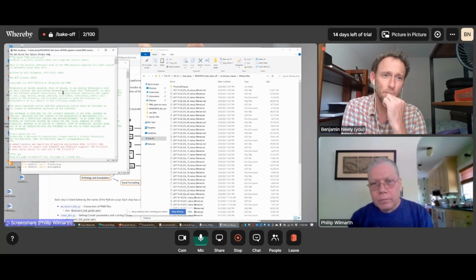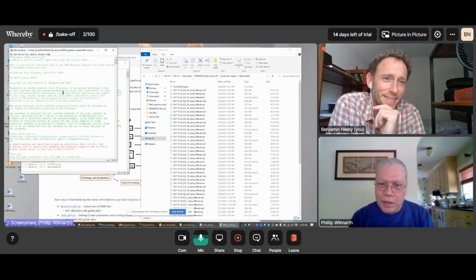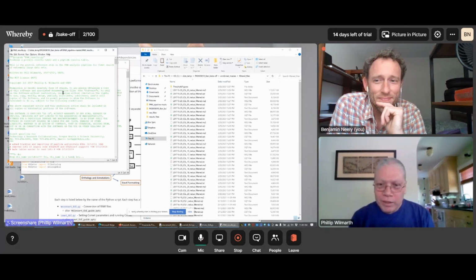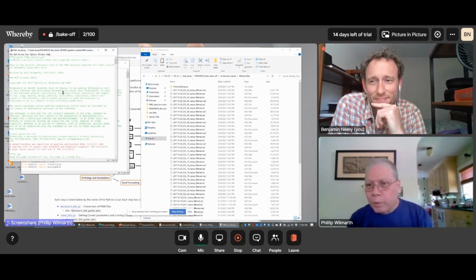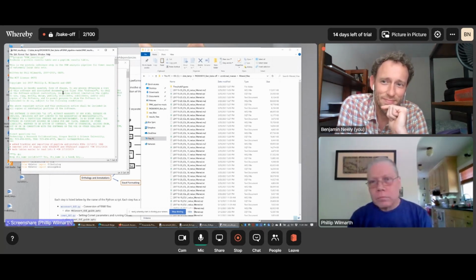But it's also a chance to actually look at the data and see what's going on. Like what we saw from the data: the first delta mass showed that there was a mass calibration issue associated with that. And then if we wanted to dig into it, we could load some subsets of the data and see that the May experiments have the one peak and the June experiment has the other peak. And we kind of understand that we've got a systematic mass calibration issue. And then we could either process the data in 2 chunks and combine them for the protein inference, or we could combine the score histograms and the mass histograms and just set wider windows. Both ways are kind of equivalent. You wouldn't get exactly the same answer both ways, but it'd be really close.